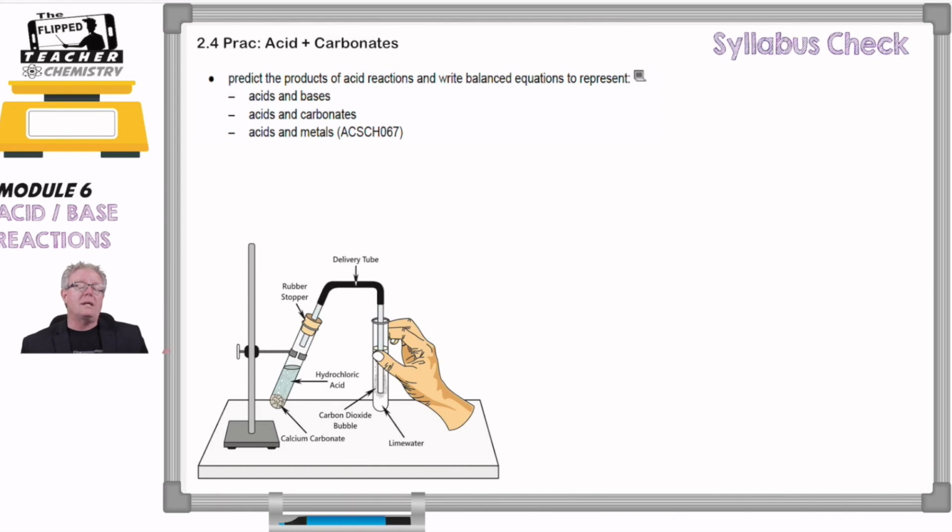All right, now I went into a quick little video looking at the practicals that are stipulated in the syllabus. And these practicals we've done before, okay? So we're going to try and look at them and revise the concepts, but just a quick little look at these pracs, because they're nothing new, but because they're stipulated in the module, we need to do and cover them. So let's have a look here.